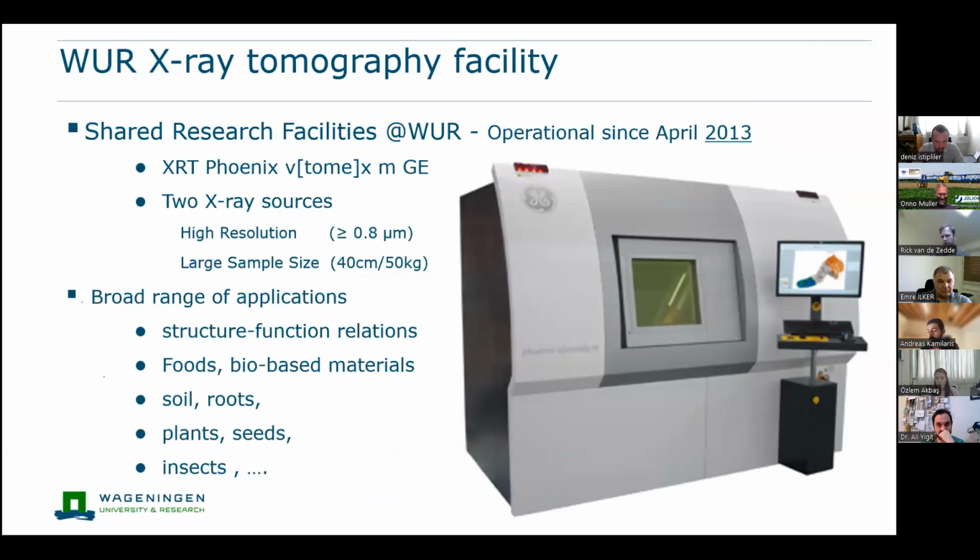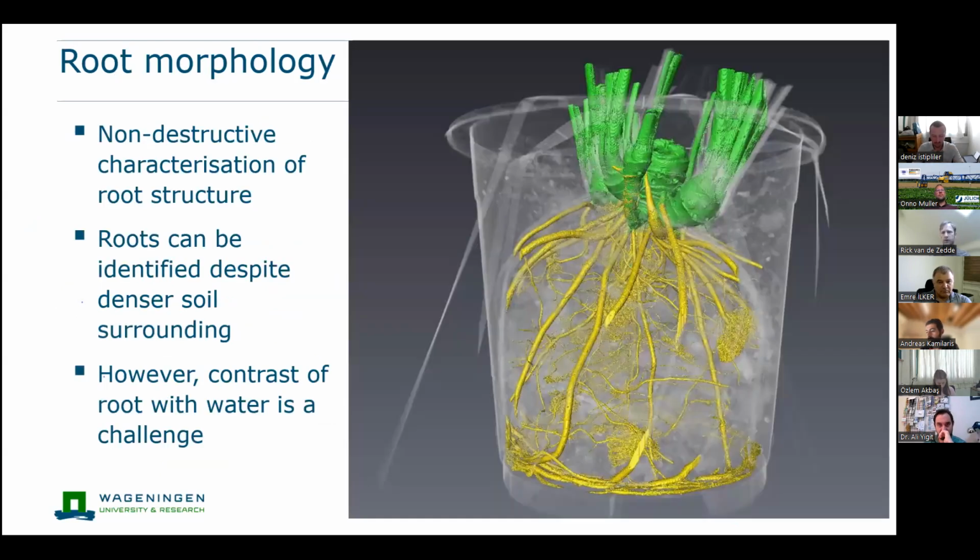But I would like to dive into the root phenotyping challenge, because the roots are hidden. So somehow you need to measure these roots, and there are all kinds of tools out there. And the most logical first idea would be to use X-ray, although X-ray is expensive and complicated. So I would like to share only a brief example. We have been working on root phenotyping using X-ray with a simple machine, and then in a pot. So that's already one drawback. You can't do it on the field.